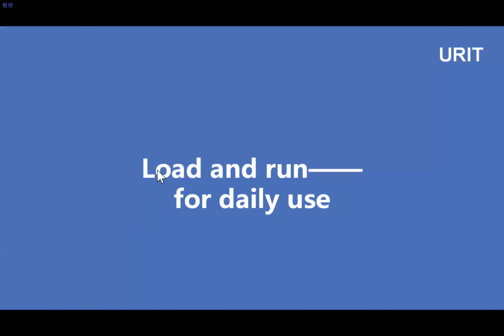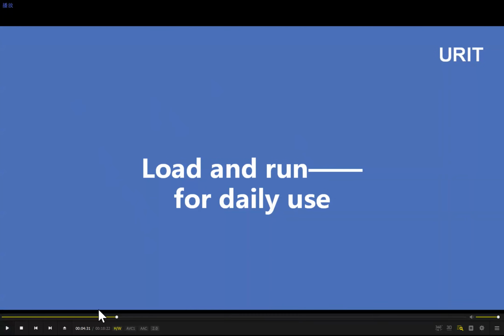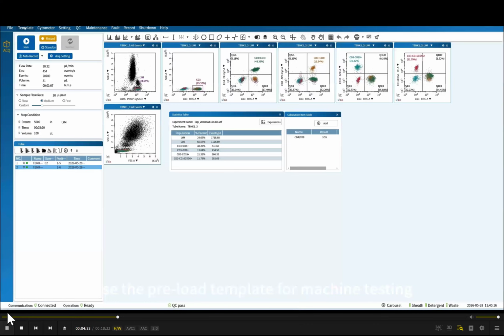Okay. Here we see load and run for daily use. I made it here to express that the following operation is for the operator, the customer, for daily use, not for the engineer. You see, use the preload template for machine testing.